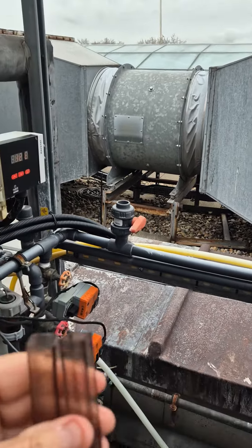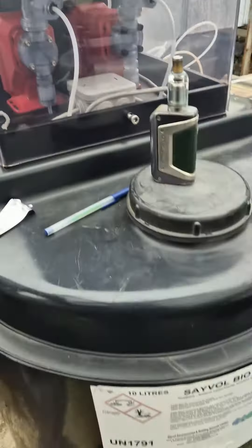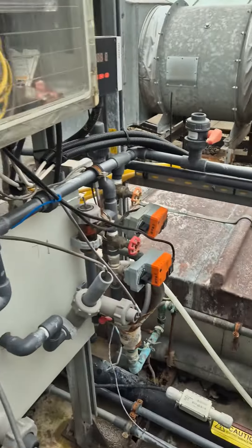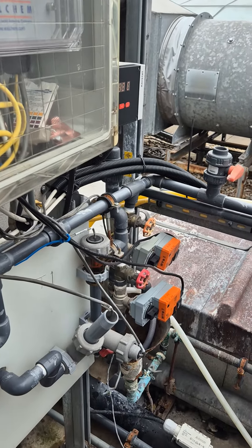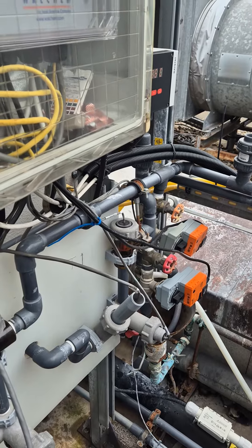Now, if you put your DPD tablet in and it's clear, you've either got no bromine or no bio-bromine going in there. The other alternative is if you've got too much going in, it will blind the sensors, so you'd have to work out what you're going to do. Hopefully this is useful.